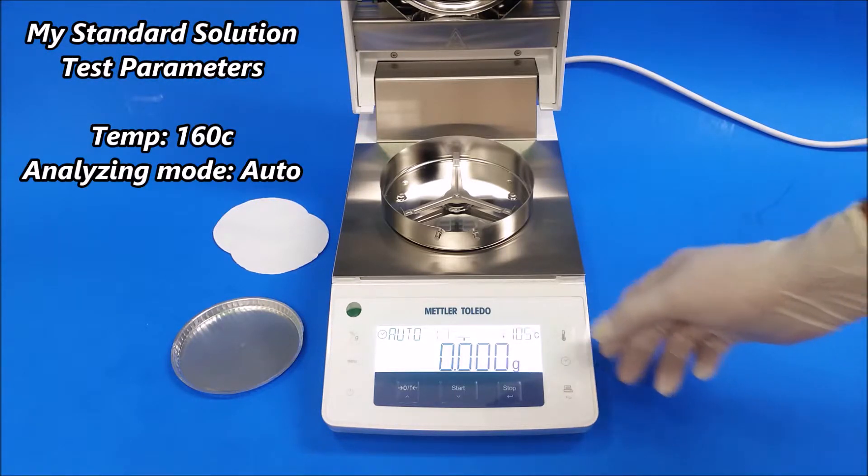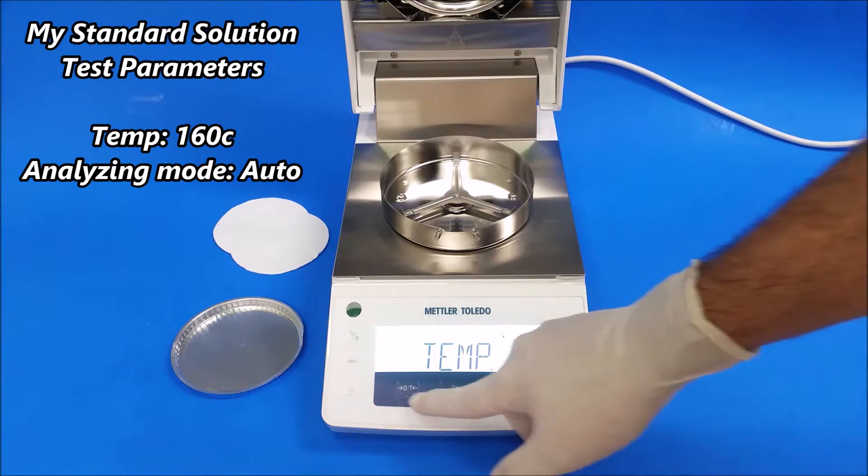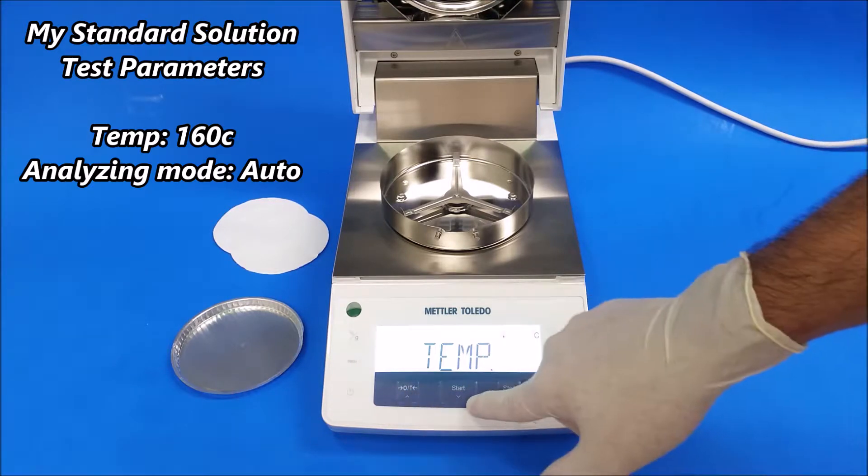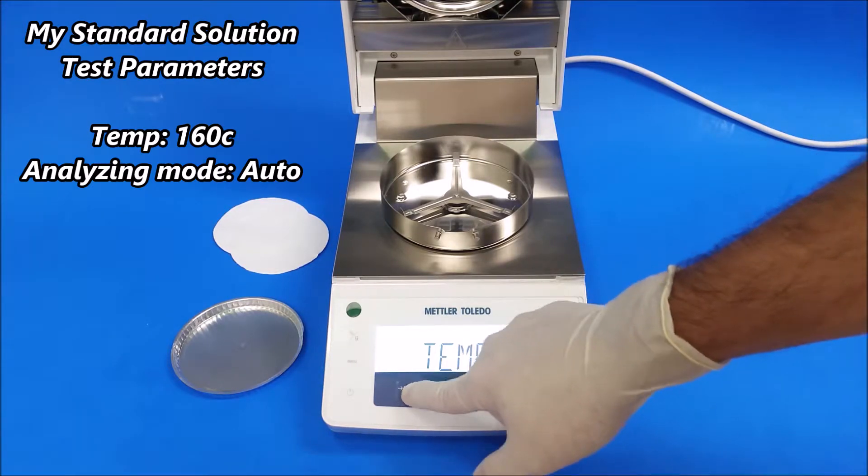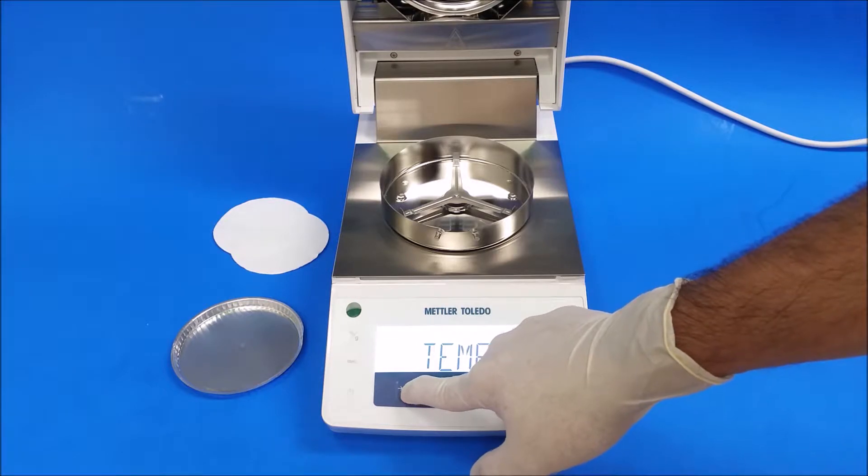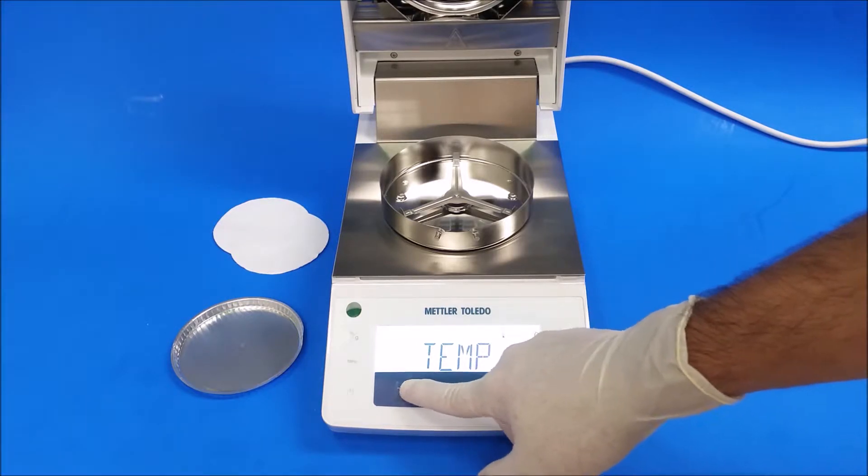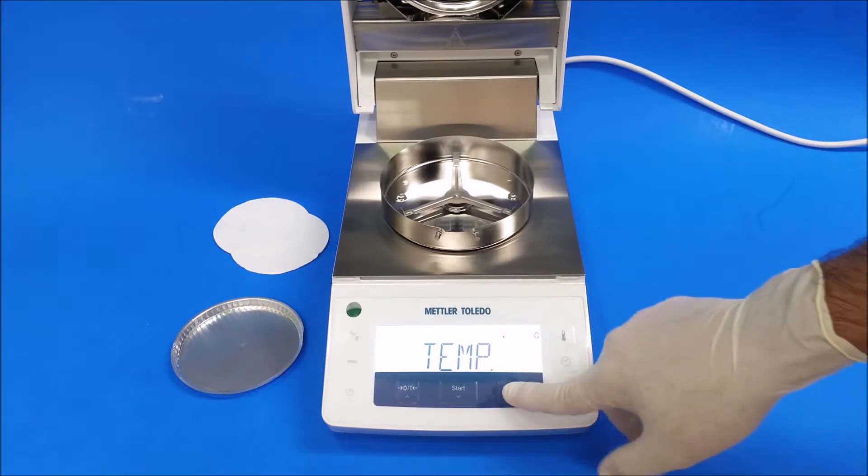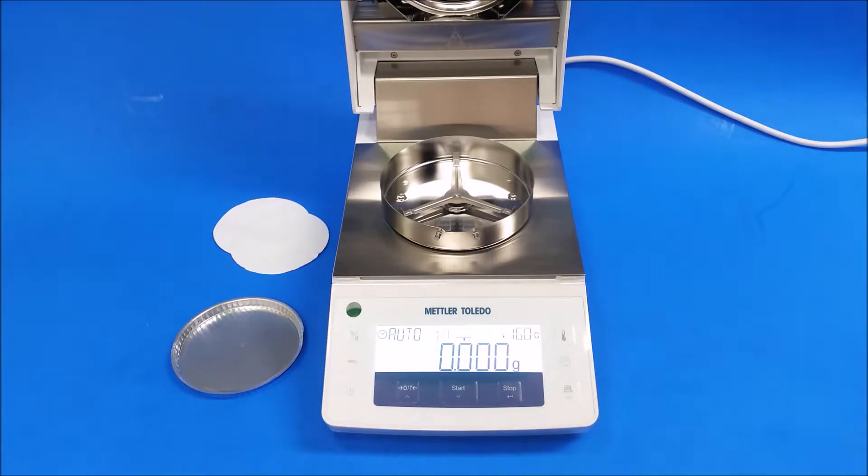There's arrow keys here, so there's an up arrow and here's a down arrow. So it's 160. Okay, now that we have our test parameter set up.